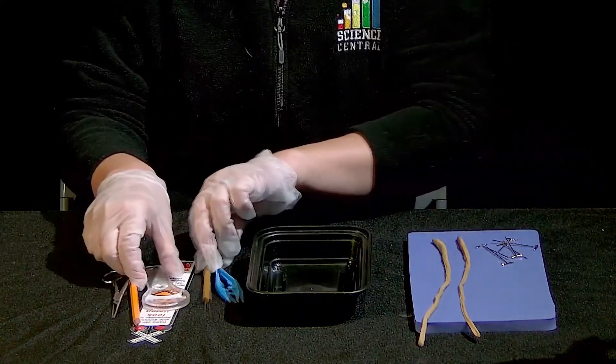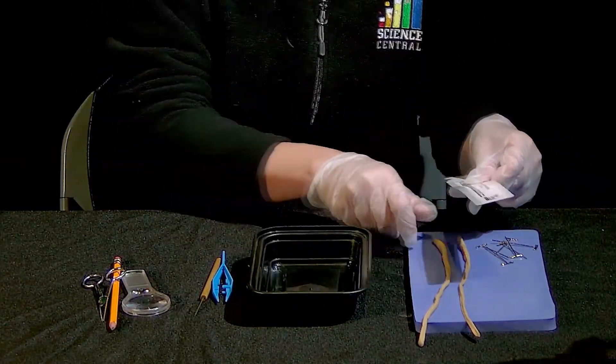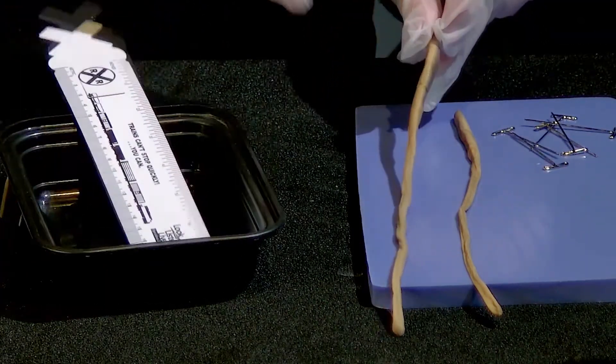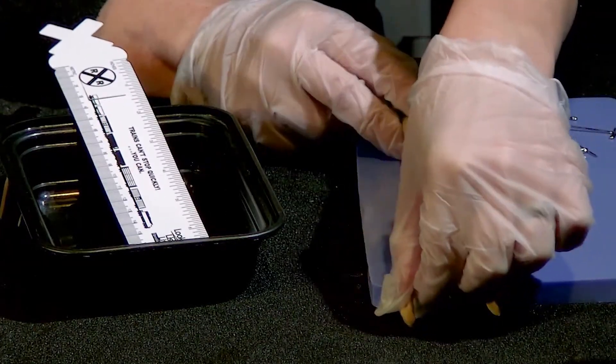When your students collect their data, they're going to measure their worm in centimeters, measuring from the anterior or head end through to the posterior end.